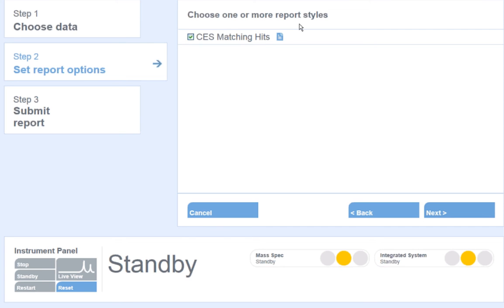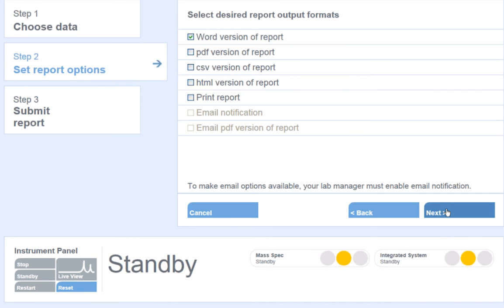Choose the report style to output your processed data. I only have one report style, CES matching hits, and this will be the report I will use to output my data.